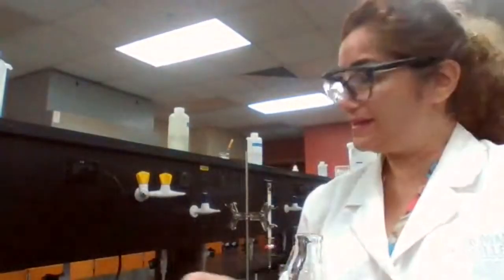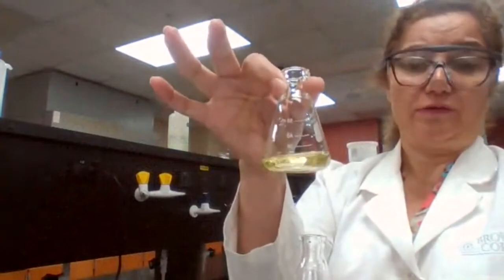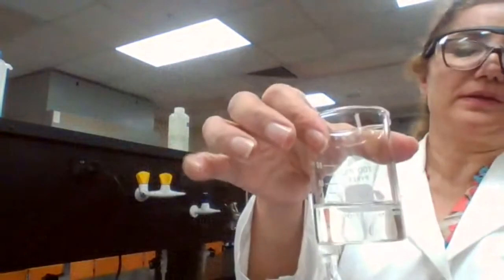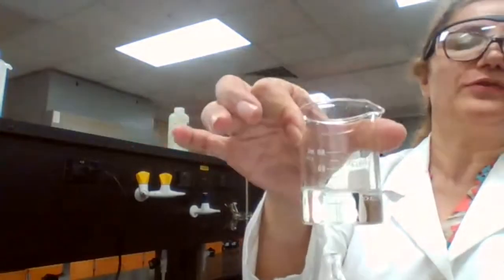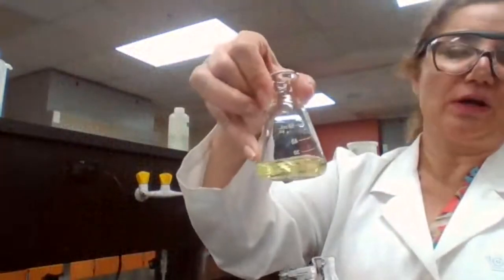The analysis for this, for me, is the qualitative analysis. I want to make sure that I have like a dark yellow color for the fluorenone. I want to make sure that no fluorenone went into the waste container, because if it did, it would be yellow color. So I didn't lose any fluorenone, and I did not collect too much of the solvent, because the yellow color still is strong.